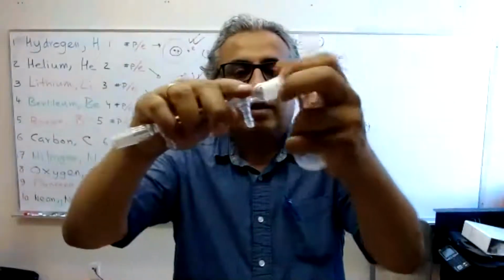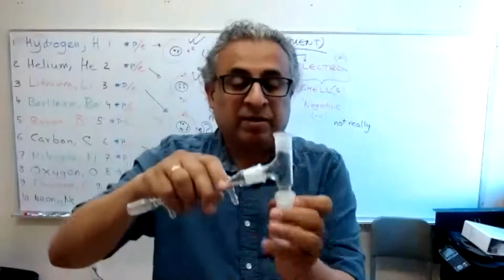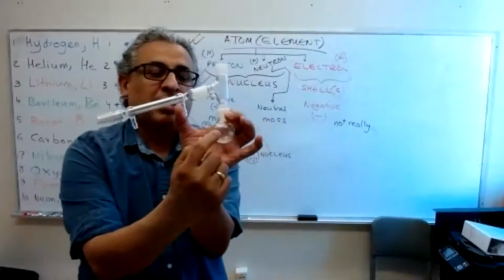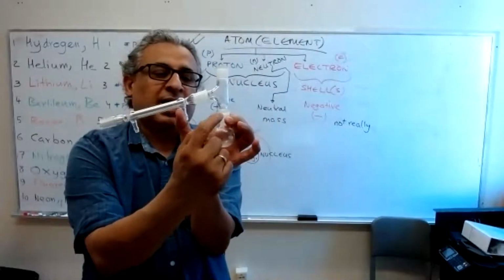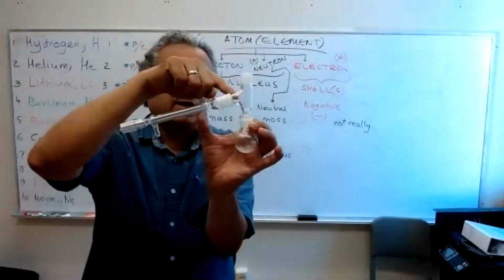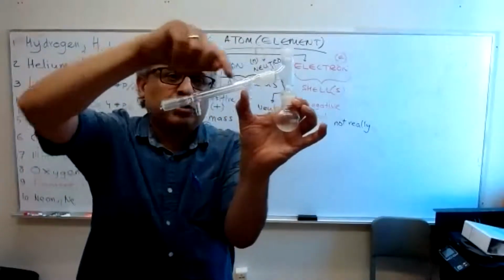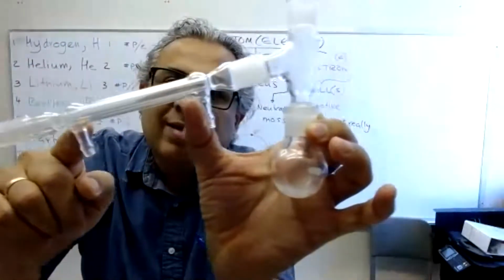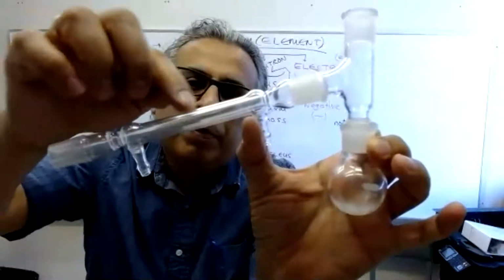Where is my flask? I don't want to drop anything, and that'll be a pretty nice demo. The liquid is in here, you're heating it up, the gas goes up, it's closed because you will eventually have a thermometer. It passes through here, through the inner line. And what if the water is going in there to fill up the outer jacket?